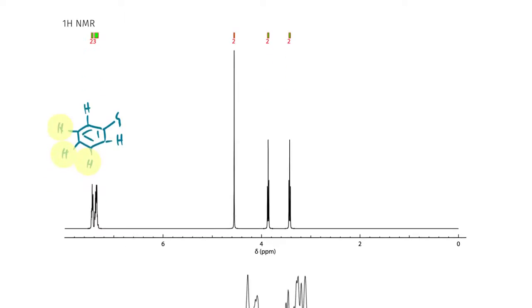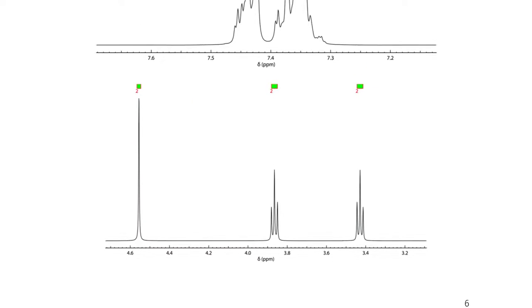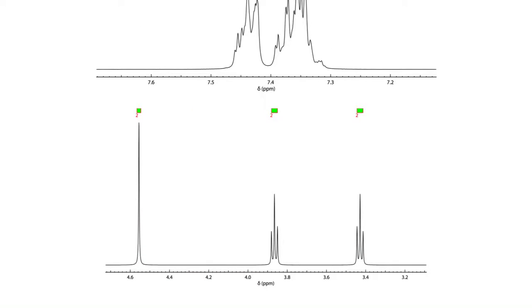So the spectrum that you have below is the blow up of the aromatic region. If you're trying to read something from that, you're wasting your time. And that splitting is crazy. Okay? So the most useful information is that you have 5 protons on an aromatic ring, and you move on. Okay? So let's move on to the area that actually shows some splitting.